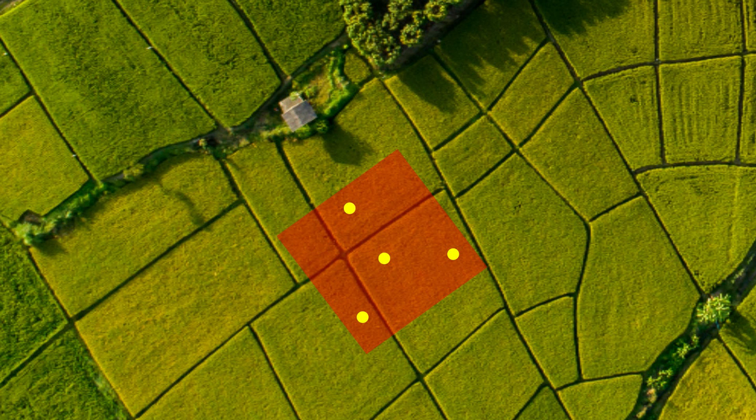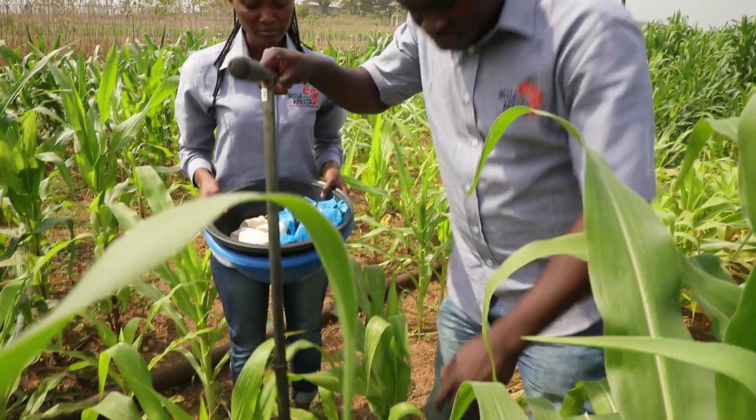Go to one of the four sub-sampling points on the Soils for Africa sampling plot. Clear the point of litter and vegetation.